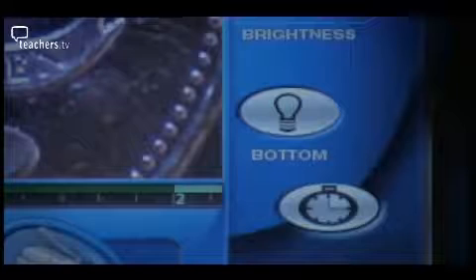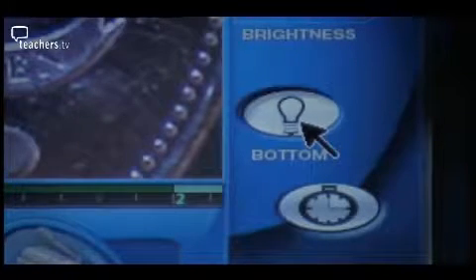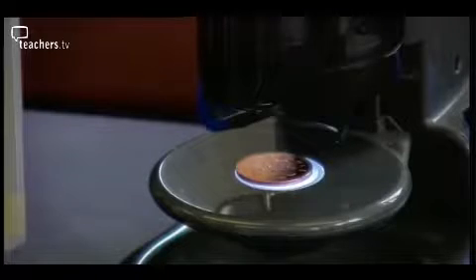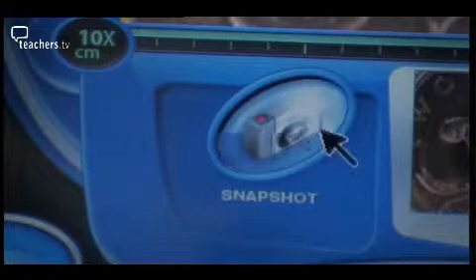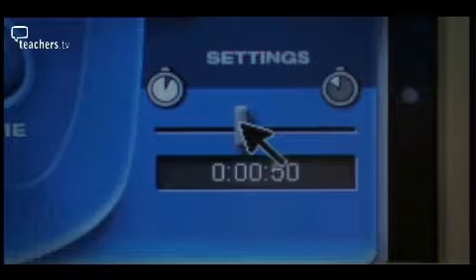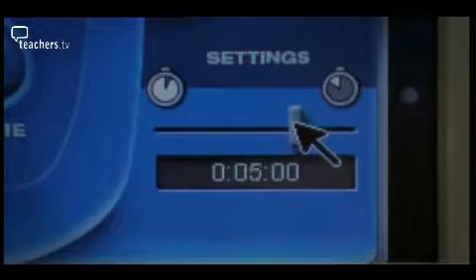There are different makes of microscope on the market, but they all do pretty much the same thing. You can capture snapshots at regular intervals, which can then be run together to make a time-lapse film. For the life cycles topic, Avril is hoping to follow the germination of cress seeds.